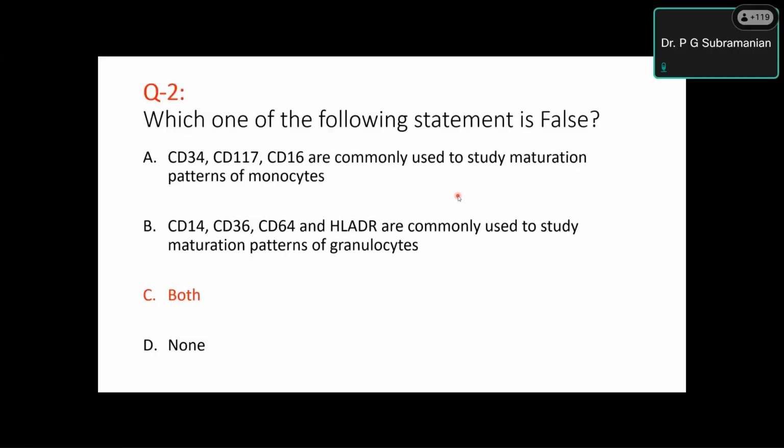Regarding CMML, these patterns are very well described in large series studies, and they are now used in disease classification also. So these patterns are good to help us in diagnosis. But if you are asking whether these patterns are specific for CMML, they are not. They can be seen in other clonal conditions, but these pattern changes, not alone but in consonance with other findings, are indicative of a diagnostic definition.